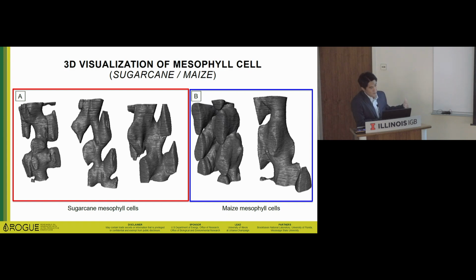I will talk about it later, but the reason is that the mesophyll cell very tightly covered the chloroplast. That's why they look like a weird pattern. I will show what the inside looks like. One of the benefits of this IGB core facility is that I can access a very fancy 3D program.